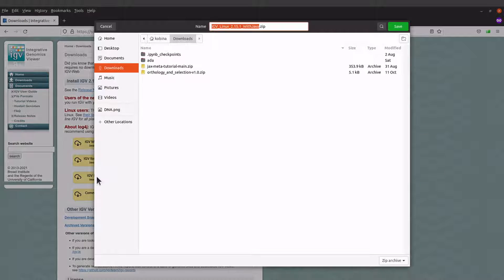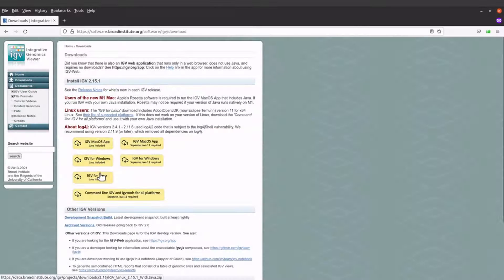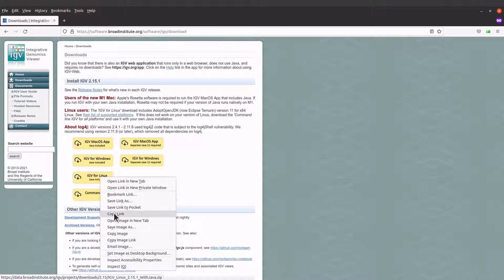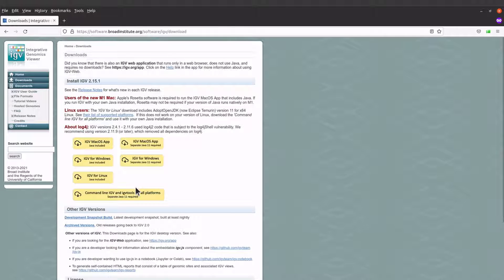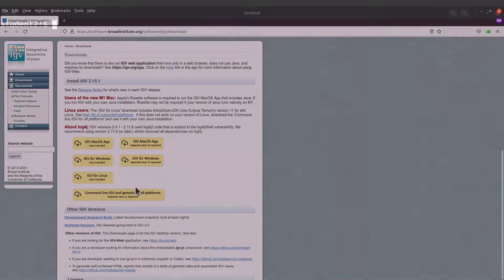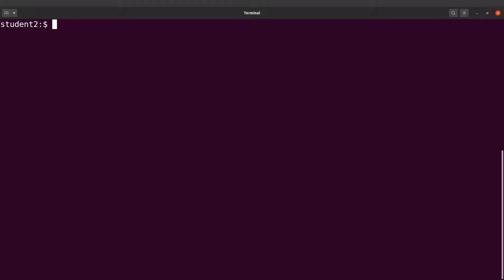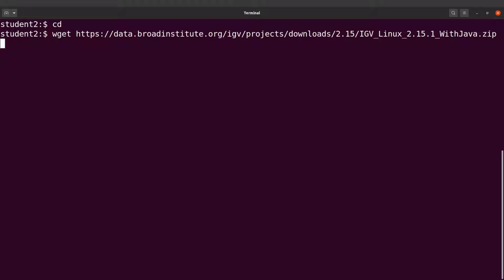We need to download the zip file which contains the binary. You can click it and be prompted to save it, but I prefer to download using the terminal. I'll right-click to copy the link, then go to the terminal. On the terminal I'll first cd to my home directory, then use wget with the link to download the zip file. You can also use curl to download it.